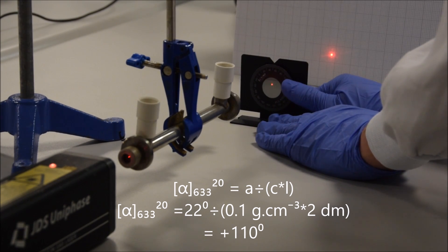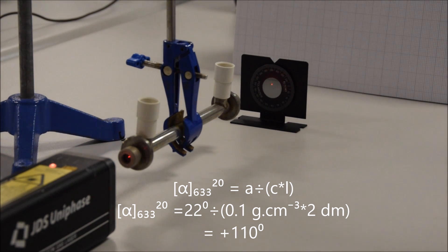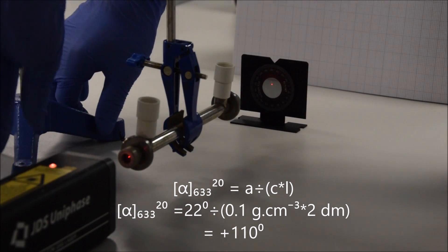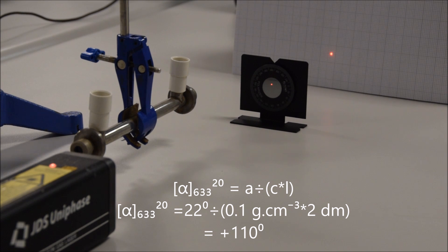We can then put this into the formula for determining specific rotation and we can figure out what the specific rotation of this material is. If you do that math, you get 110 degrees. It's 110 degrees per gram per centimeter cubed per decimeter. You've got to make sure you get your units right before you do that calculation. If I take it out of the way, the light makes it through the polaroid again.